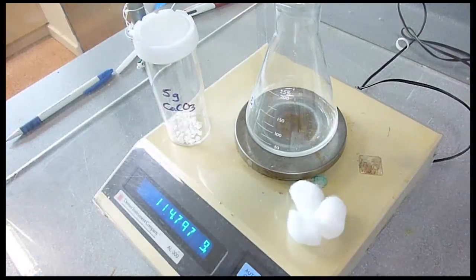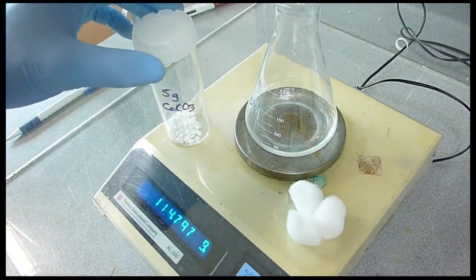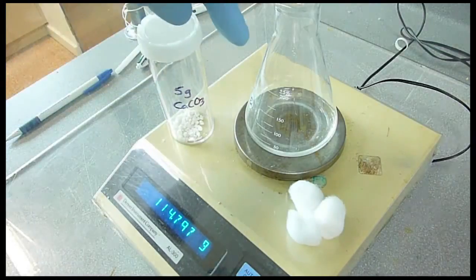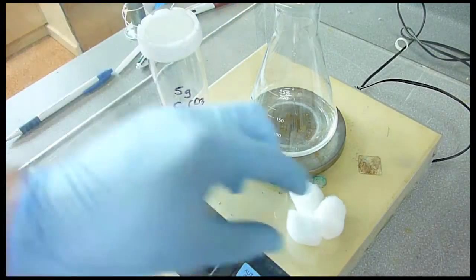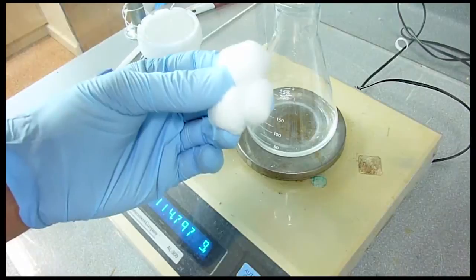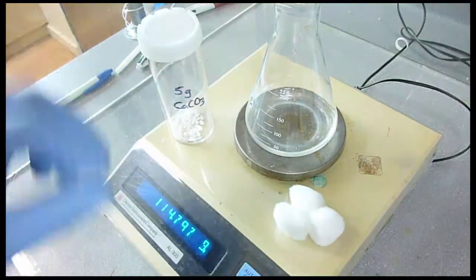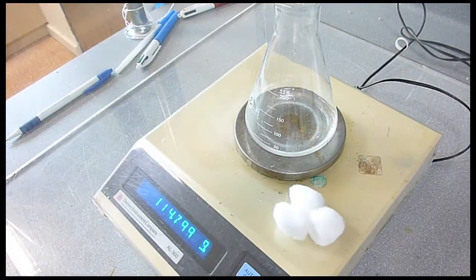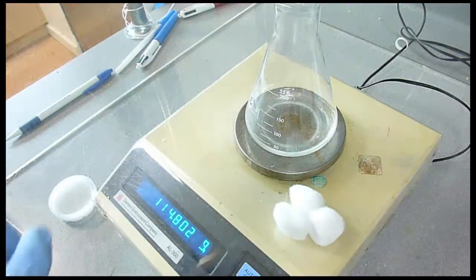Measuring the mass change rate of reaction. Five grams calcium carbonate, 20 mils hydrochloric acid, cotton wool balls to stop any splashing. You can see the mass down there. We're looking for the mass lost. Let's see what happens.